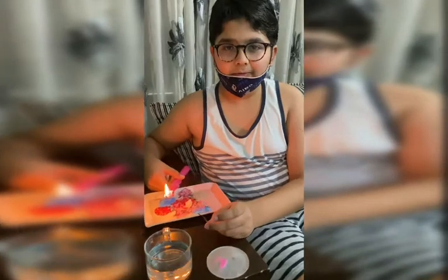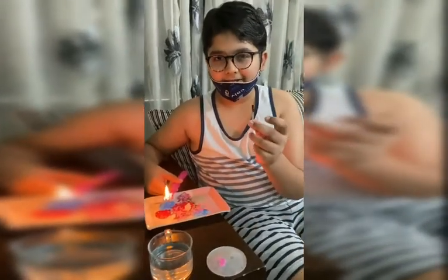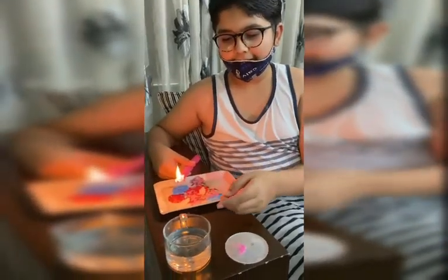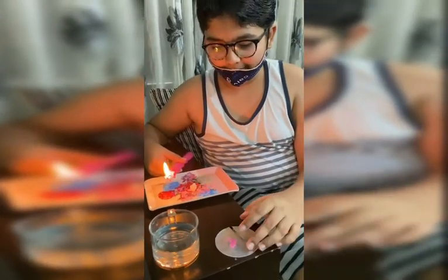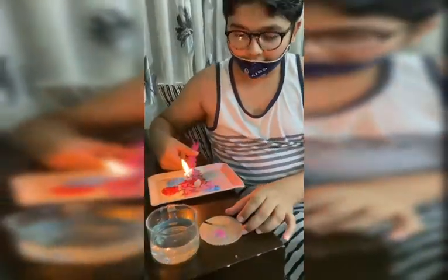Hello everybody, today I'm going to perform my activity. This is a magnesium ribbon, this is a candle, and this is a cup of water. I'm going to burn this magnesium ribbon and put it into water.